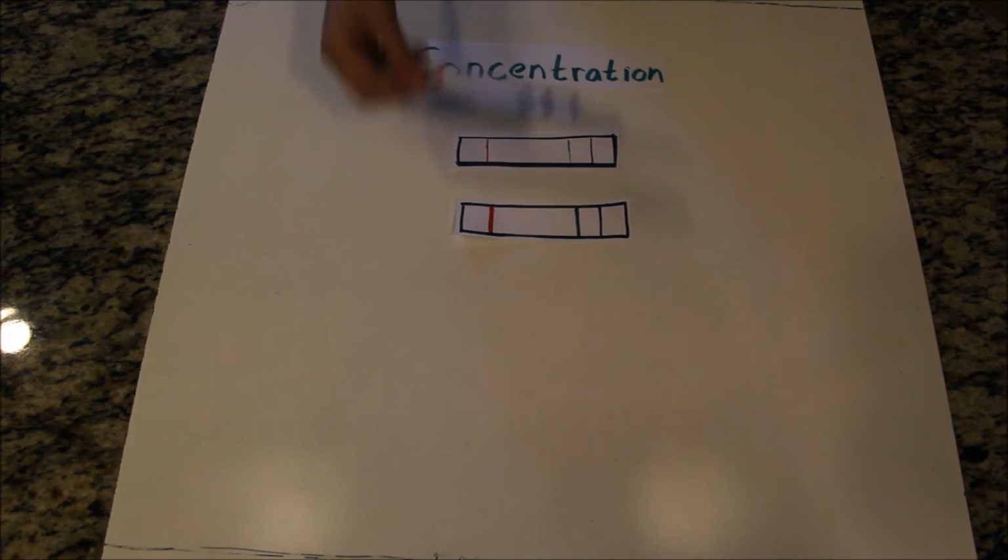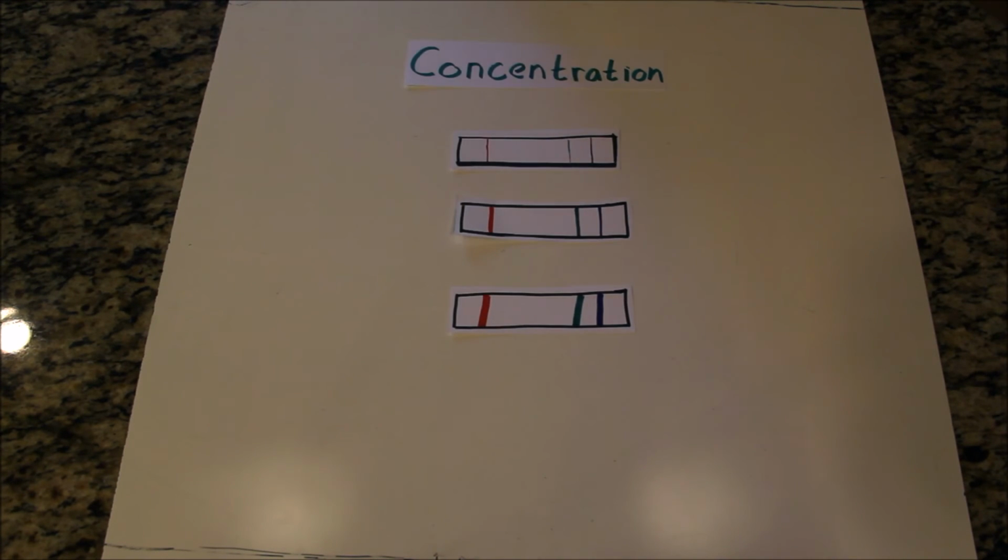The concentration can also be determined by looking at the rate photons are emitted compared to a calibration curve. The curve is useful because there can be variations in light intensity based on changing conditions in the plasma. Intensities of sample lines of known concentrations of the element are compared to the intensity of your sample. Each element has its own calibration curve for each line on the spectrum that determines the intensity of the light emitted based on the concentration, or vice versa.